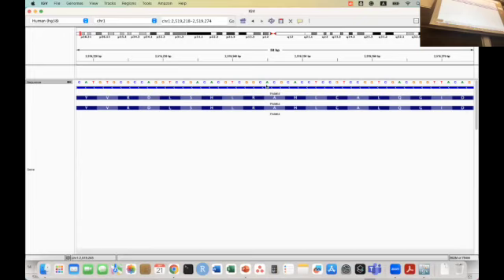Pardon? When you press that arrow, does it convert to complementary? Yeah, okay, the question is, when I do that, what's happening? Do you see that G? What is the complementary base of the G? It's a C, right? So it's going to be C. What is the complementary base of T?